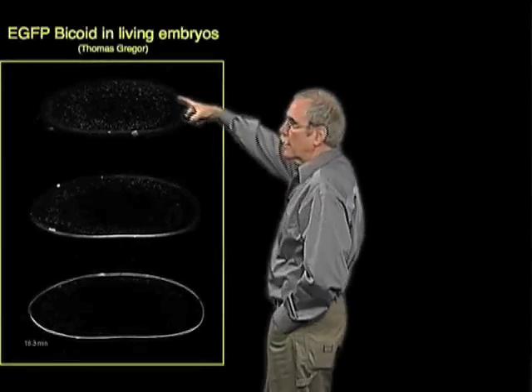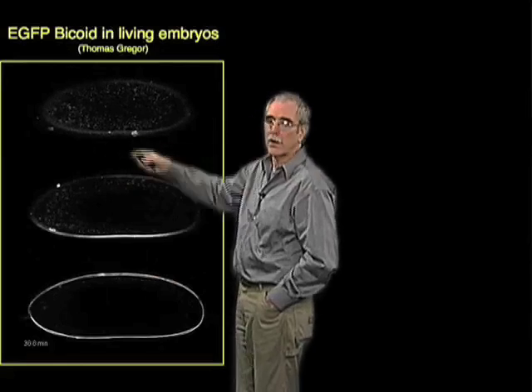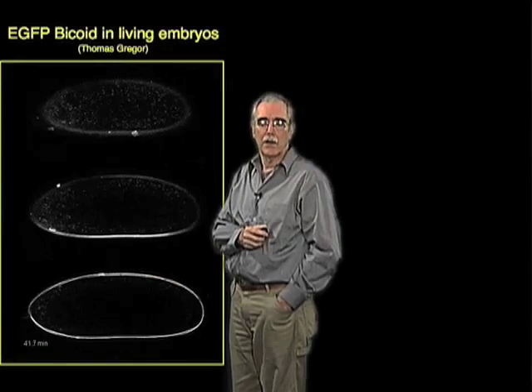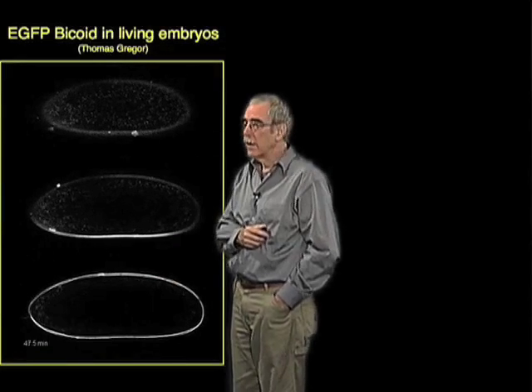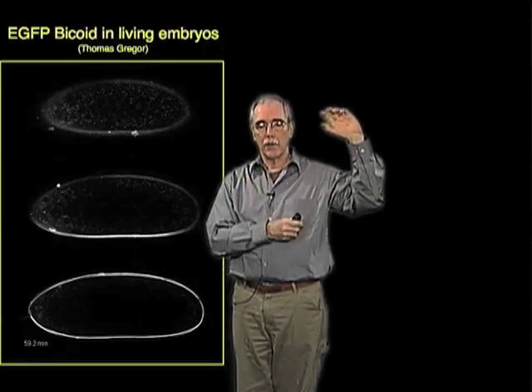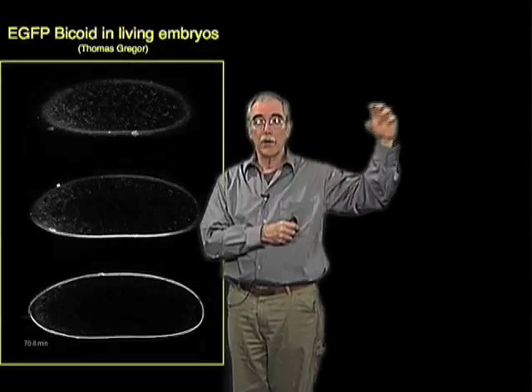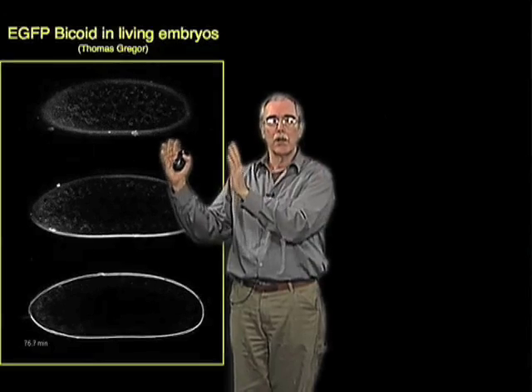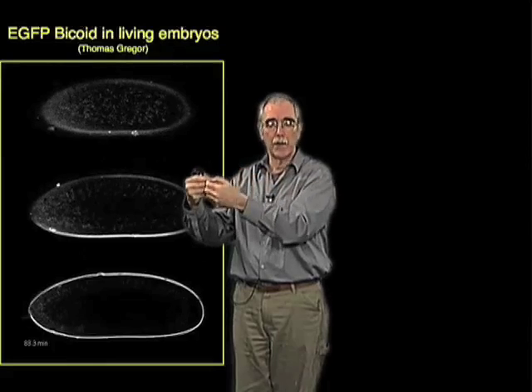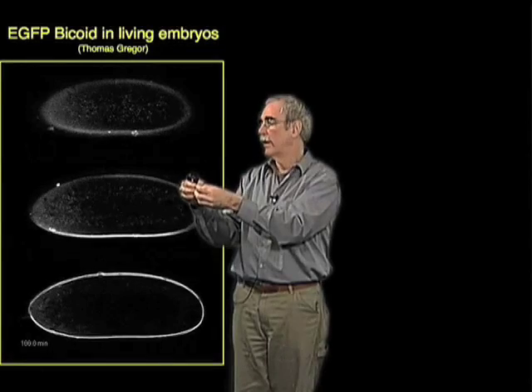These are living photographs at different levels of a single Drosophila embryo that expresses this EGFP-bicoid transgene that Thomas Gregor made. The transgene is under control of the normal bicoid transcription controls during oogenesis. It also has the normal 3' UTR of the bicoid RNA, which is the part of the RNA involved in localizing that RNA to the anterior end of the egg.